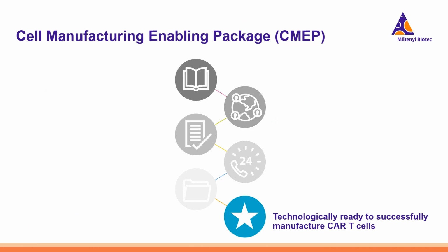And as said, the final goal of all these activities and documentation is to bring the site and the team to the point of technological readiness to start manufacturing CAR T cells, meaning that they know how to run the process, they know how to create batch records, and they can then start actually working towards reaching GMP compliance with then the ultimate goal of starting clinical trials for CAR T cells.